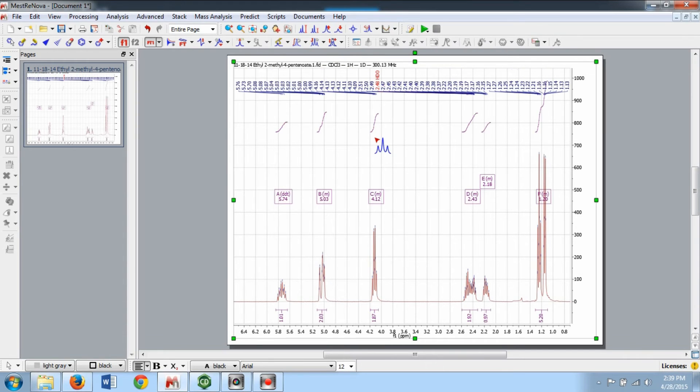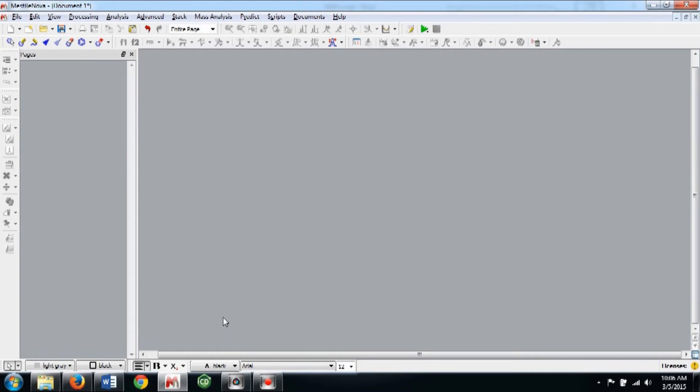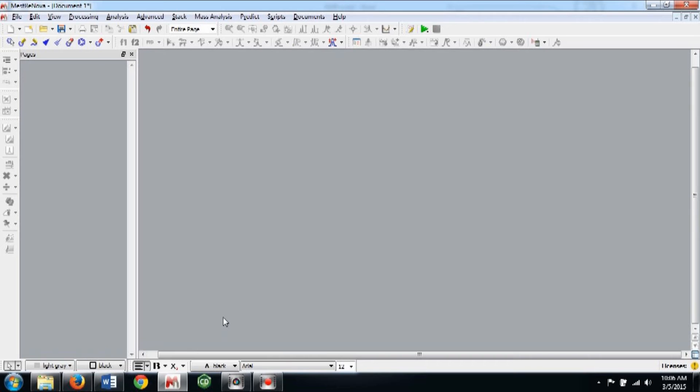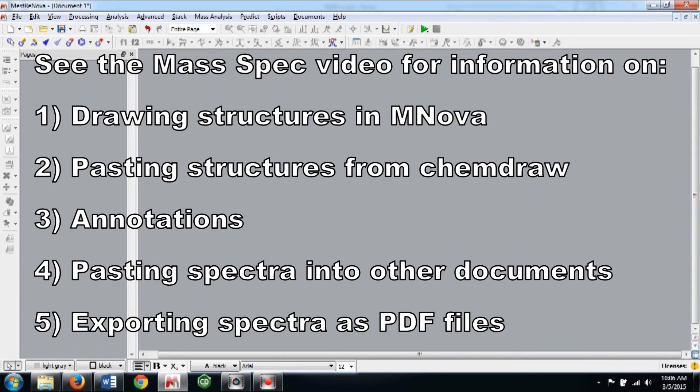Additionally, if you've already picked peaks, the Auto Analysis will only be done on the peaks that you've selected. As mentioned in the MassSpec tutorial video, MestreNova is a very powerful program and there are many tools you can use to make data analysis easy. This section demonstrates a few extra tools that you may be able to utilize and you are encouraged to explore all of MNOVA's capabilities on your own.